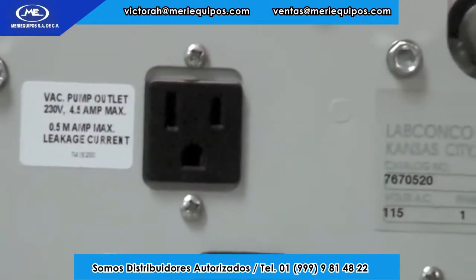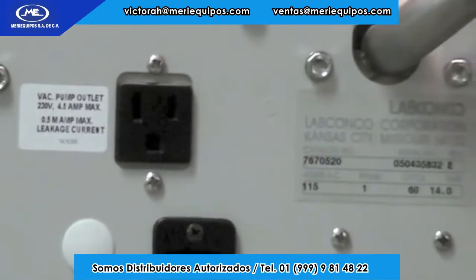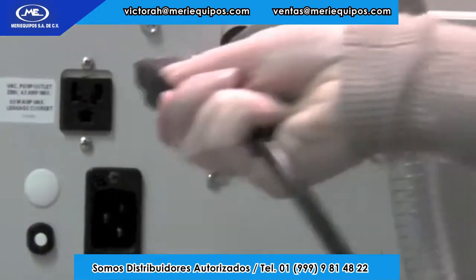Next, plug the vacuum pump's power cord into the receptacle located on the back of the freeze-dryer.